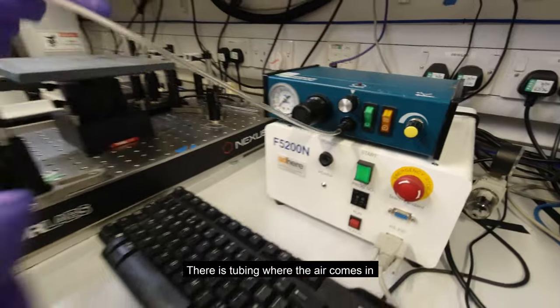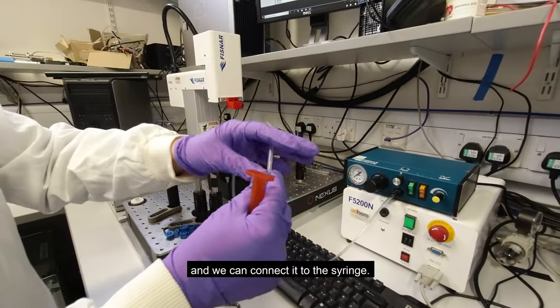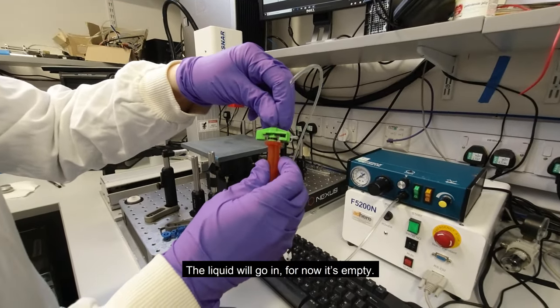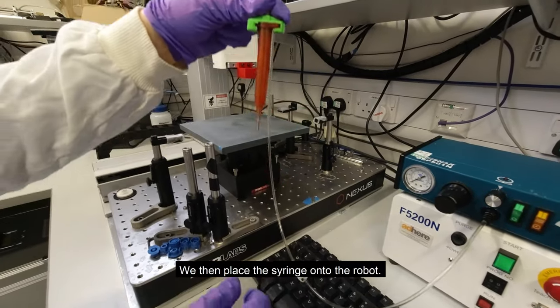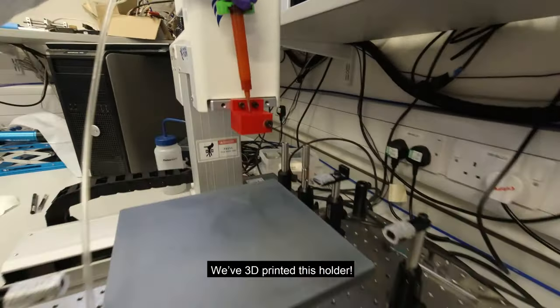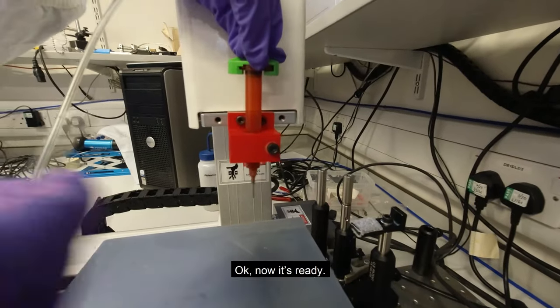Let's show you how it works. There is tubing where the air comes in and we can connect it to the syringe. The liquid will go in, for now it's empty. We then place the syringe onto the robot. We 3D printed this holder. Ok, now it's ready.